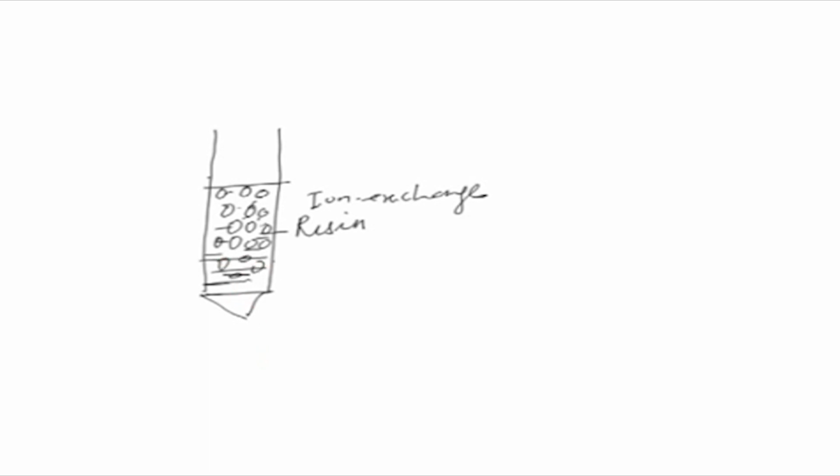All right. Now, what you will do is, there are two ways, like through peristaltic pump, as we were discussing in earlier lectures. You can do it by peristaltic pump, or you can manually load the sample. So, if I have to manually load the sample, then I can load it with a micro pipette. In ion exchange you can have any volume of sample, as this is a displacement kind of chromatography, where the ions or ionic species will bind to the oppositely charged ion on the resin.